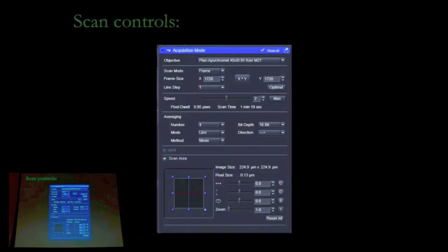That's first the settings for specific channels, and then for the entire scan, you're going to have a scan speed. This will determine how long the PMT will be sampled for each pixel. It's also going to determine the size of the pixels, because the scan is going to be over a fixed distance, and however many pixels you divide that up into is going to determine the size of a pixel. There will be a calculator button to set the pixel size to match the resolution of the system, and that'll again be determined by the numerical aperture and the shortest wavelength of light that you're collecting.